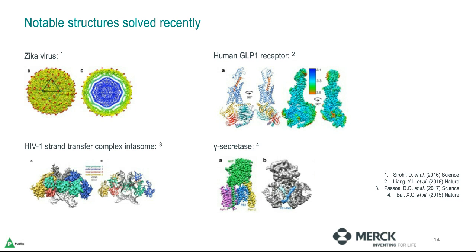They are, in general, very challenging to work with because they are very difficult to purify because they are not very stable. In this case, the whole complex is 150 kilodaltons, and there have been very important advances in the study of this kind of proteins by CryoEM. In this specific case, their structure could be useful to fight type 2 diabetes and obesity. And with this, I leave the presentation to Ali.